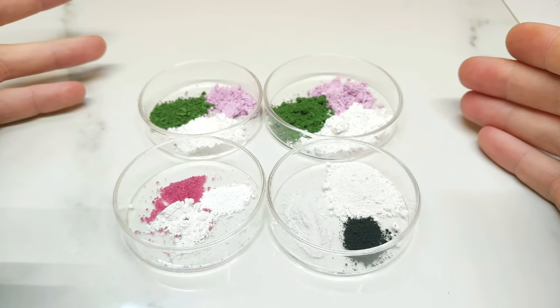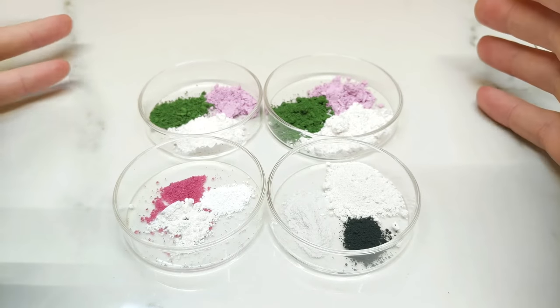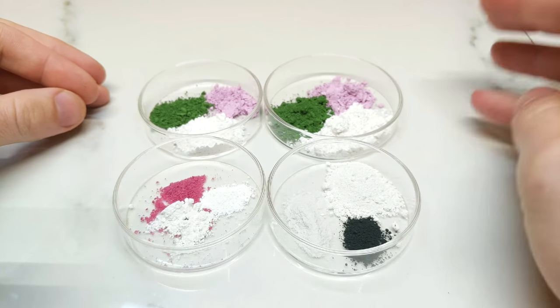Hello and welcome back to the Alchemical Arts. Today I'm continuing my cobalt series and I'm reattempting my Turkish green cerulean blue sort of turquoise cobalt-based pigments.